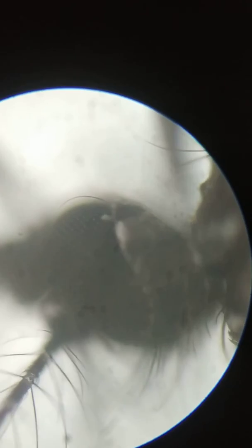Here you can see the head of the mosquito under high power. Now when I focus and bring it in and out of focus, I hope you are able to see the compound eyes on both sides of the head. There you can see the compound eyes — so many lenses seen on the two sides of the head.